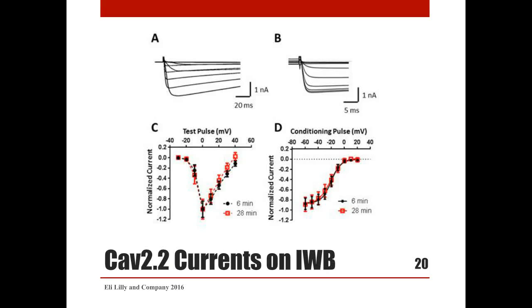This slide illustrates barium current conducted by recombinant N-type calcium channel recorded on IonWorks Barracuda in population patch clamp mode. Similar to manual electrophysiology, the current activated rapidly and inactivated slightly during the depolarizing pulse. The current-voltage relationship shows relatively steep voltage dependence, most likely resulting from imperfect voltage control on Barracuda. Stability over time was excellent. Steady-state inactivation was examined with a series of one-second conditioning pulses followed by a test pulse to zero millivolts. Fitting the Boltzmann equation to test pulse amplitudes indicated a half-inactivation voltage of approximately minus 20 millivolts, and steady-state inactivation was stable in time.